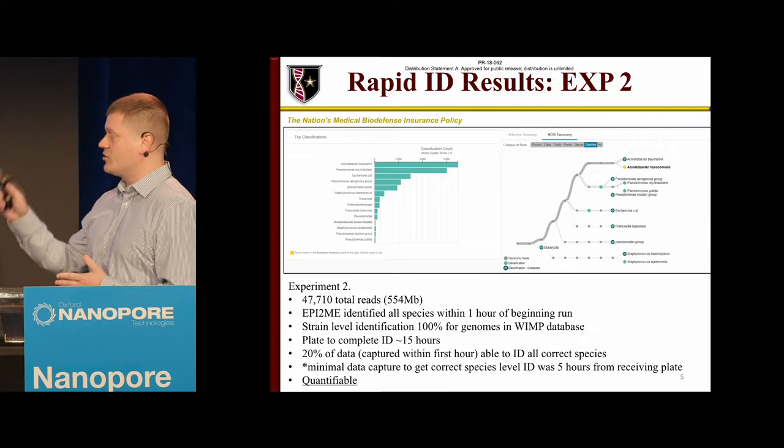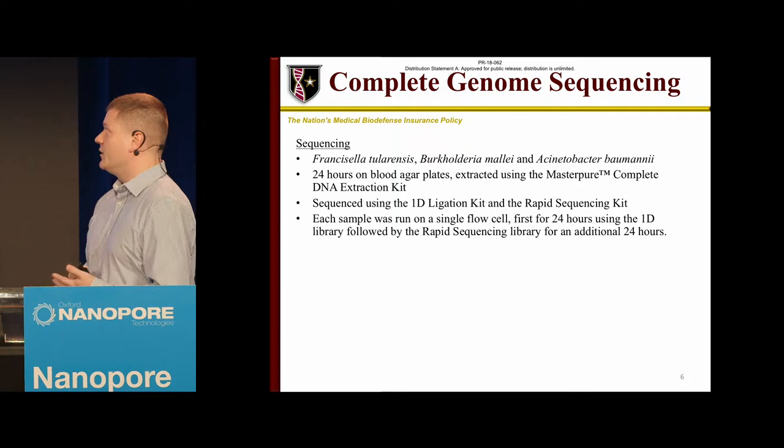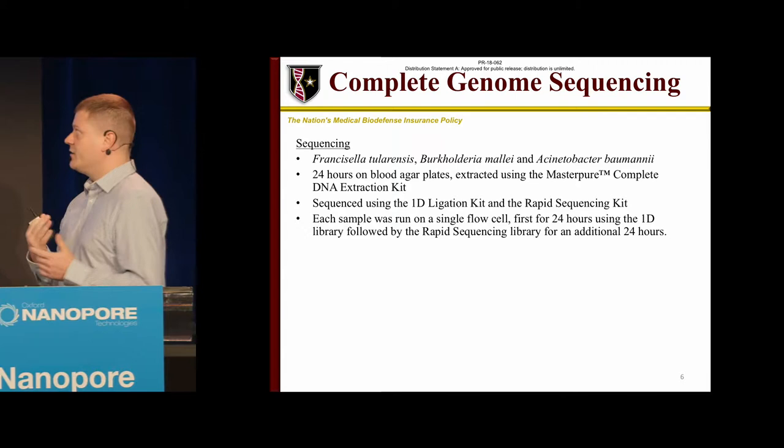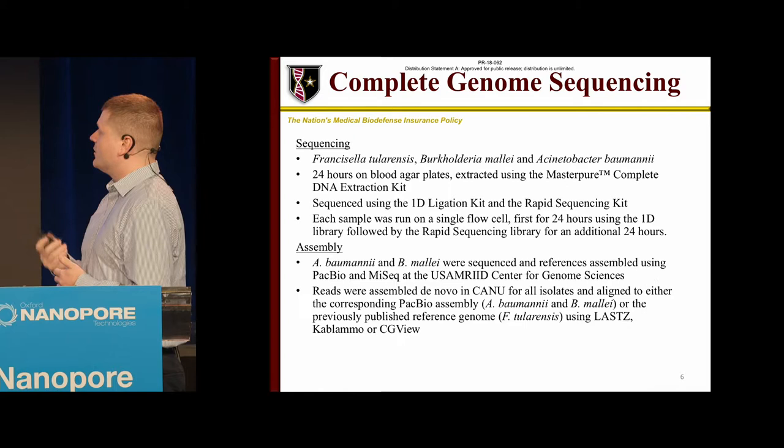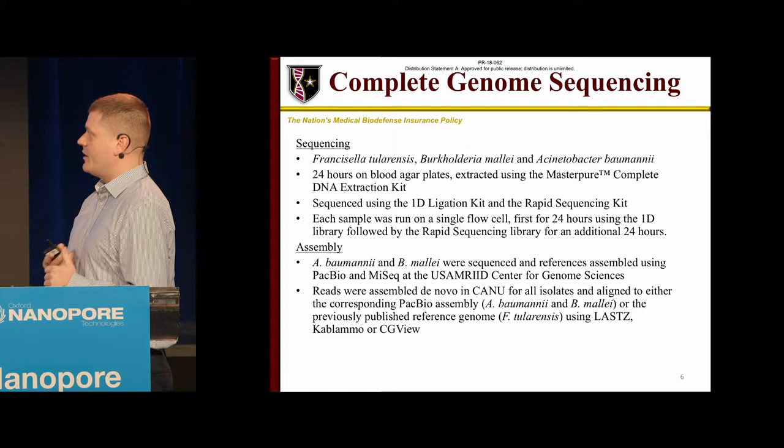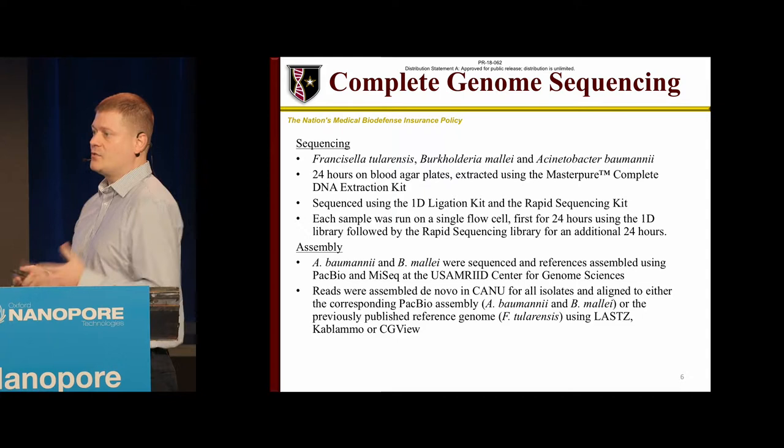Complete genome sequencing, kind of what you'd expect. We did a Francisella, a Burkholderia, and an Acinetobacter baumannii. Again, grew them on a plate, pulled the colony. For these, we did one fresh flow cell for each one. We did a 1D for 24 hours, followed by a rapid for 24 hours, washing in between. The Francisella was the GenBank reference genome, and the baumannii and the mallei we sequenced at CGS on our PacBio and/or Illumina to get a complete reference genome to align them all together. And what we found was not surprising.